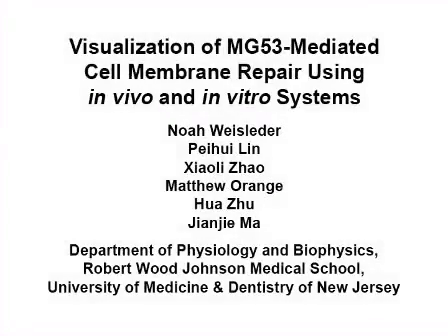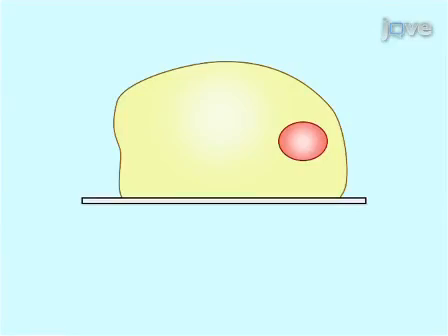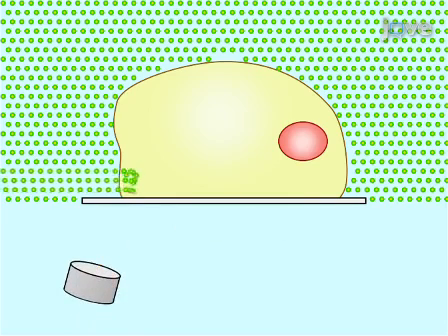The overall goal of this procedure is to assess membrane repair capacity in both the animal and isolated cells. Isolated skeletal muscle fibers are collected and surrounded with media containing FM143 dye. A UV laser is then used to irradiate and damage a portion of the cell membrane to allow entry of the dye into the cell.